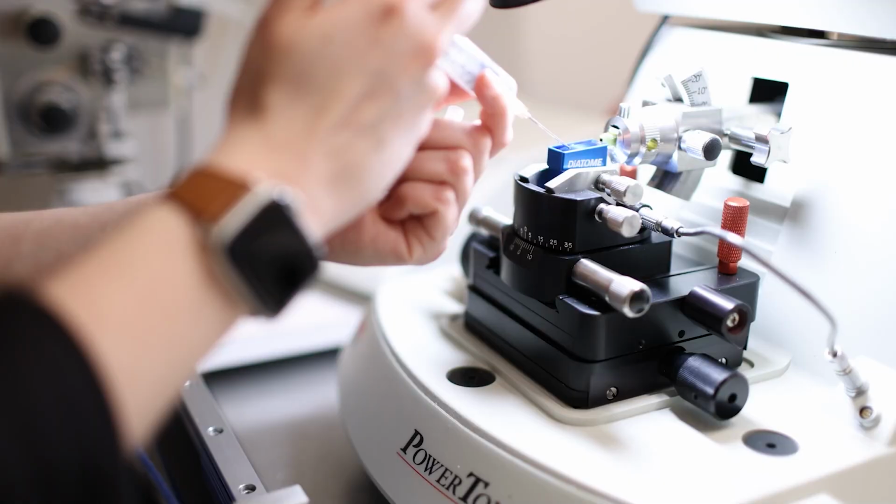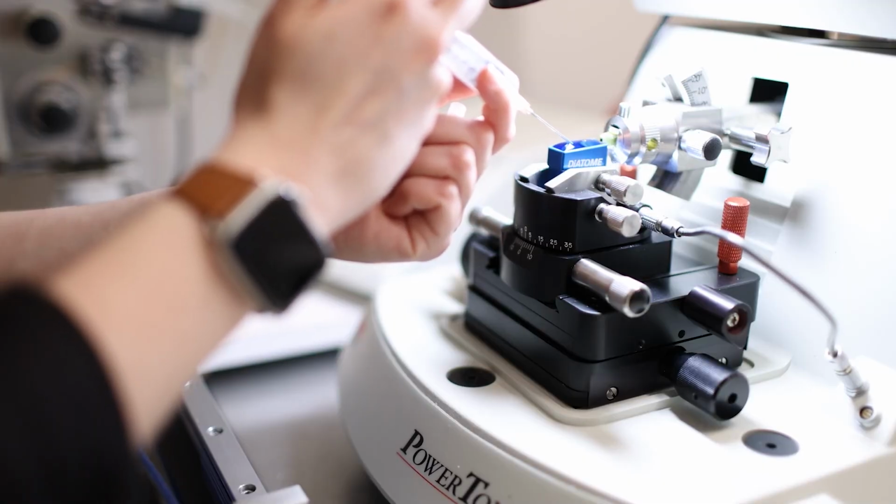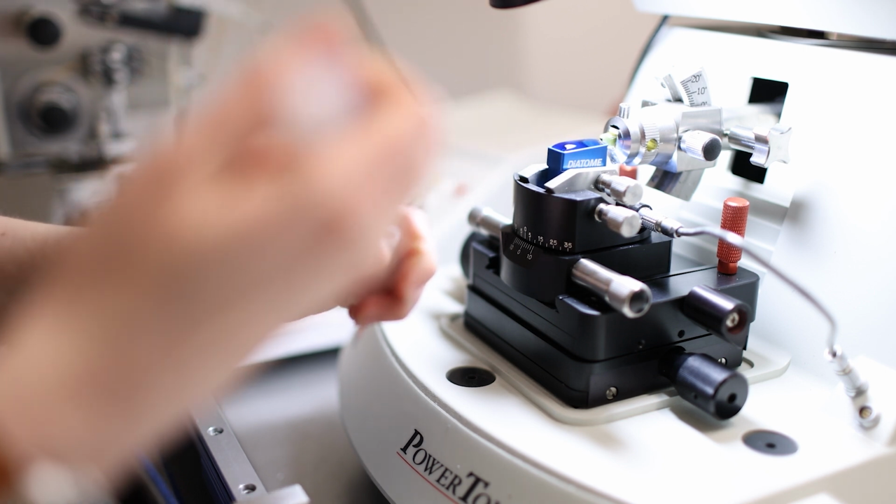The correlative part is that we are going to use more than one technology. So in our unit, we tend to use a lot of correlation between light and electron microscopy, because light microscopy can have a lot of chemical specificity. It can tell you, for example, which parts of your sample are the disease area versus the healthy area and things like that. While electron microscopy has a much higher spatial resolution and can give you more of the context as to the intracellular morphology, which can give you information about the underlying causes of the disease as well. So that's the part where we correlate.